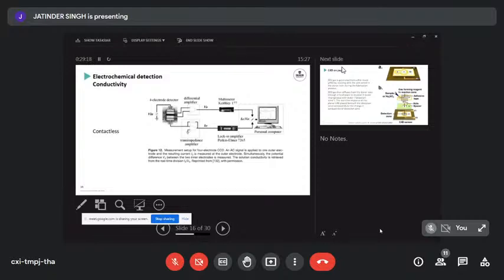So I did this partially in Tasmania, partially in Peter House's group in 2010. This probably cost $2. That was my little revenge on that $20,000 chip. Sensitivity is the same, no difference in performance. So it doesn't always need to be expensive and fancy.